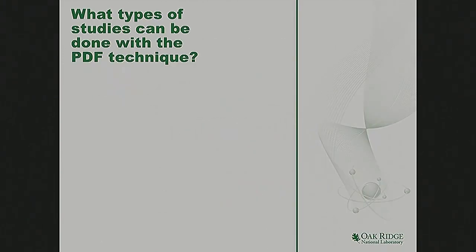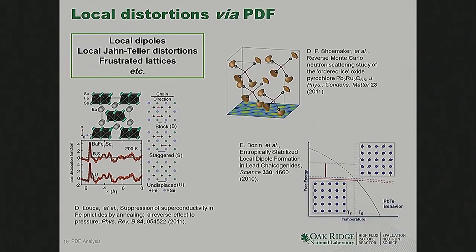Okay, so what types of studies can be done with PDF technique? I'm going to go through 4 kind of general overview slides, and then we'll drill into a few specific examples. So the first kind of topic or theme is local distortion via PDF.